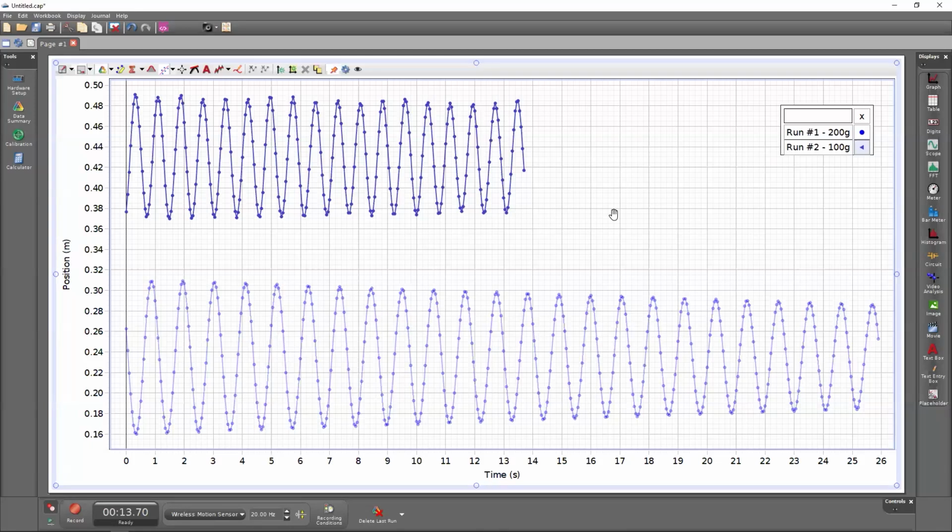How do I analyze multiple data runs in a graph, say with a curve fit? Here's the curve fit tool. And this button's interesting because the left part of the button is already on. Why don't I see any curve fits? Well, it's because the curve fit has not been selected yet from the right drop-down portion.